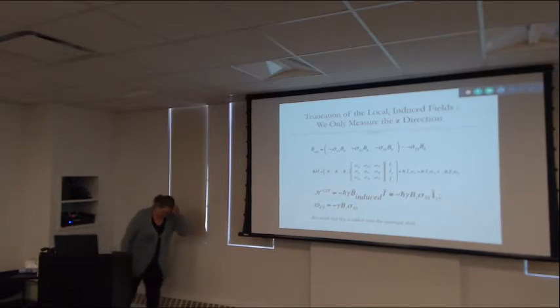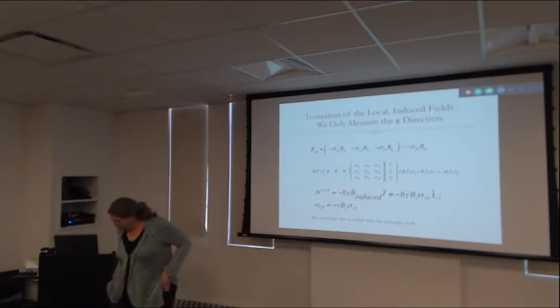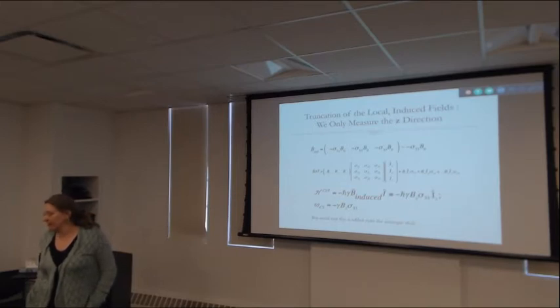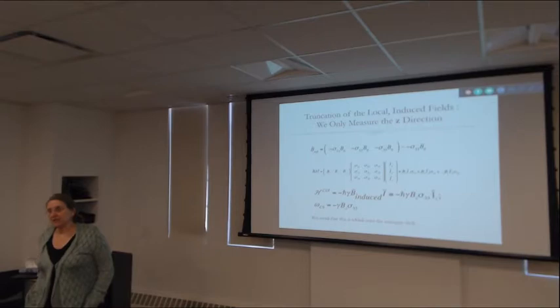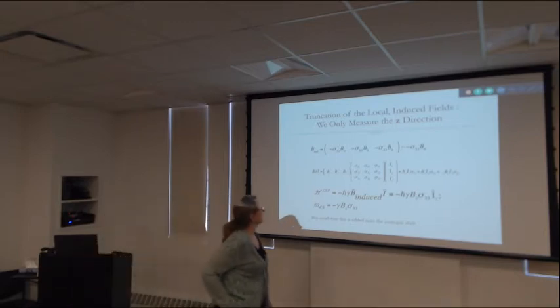Now, this is another simplification because for today and for tomorrow, our goal is to predict instantaneous chemical shifts and then predict spectra. So the first simplification, that B naught is along Z, is exact, and it's just a coordinate system convention. So there's nothing more to discuss about it. The next simplification, there's always something to debate about it. There's always something to discuss about it.